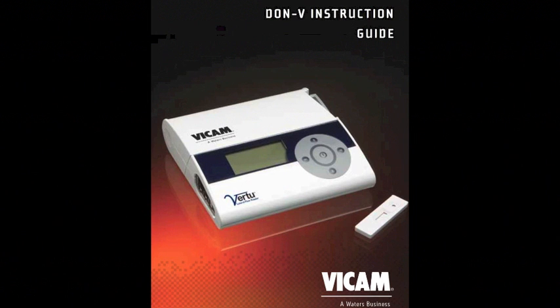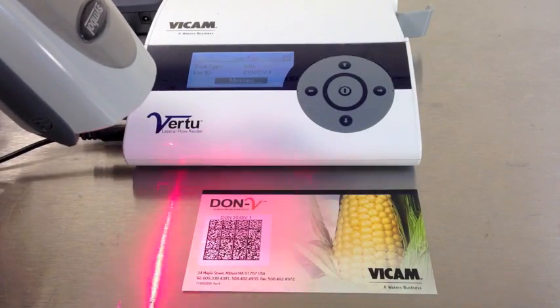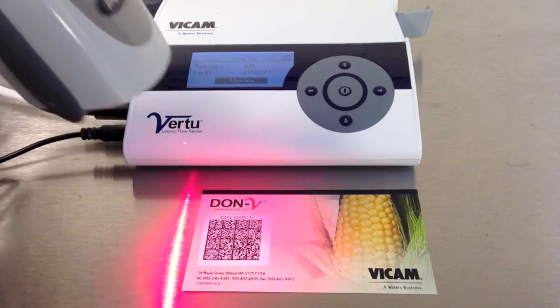The Vertu unit is capable of testing different commodities and toxins like Aflatoxin and DON. To select the test, scan the barcode on the test card provided with each lot of test strips. The screen will change to show the current test as well as the lot number of the strips.